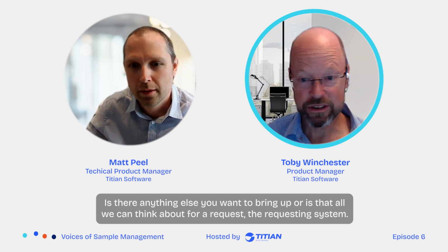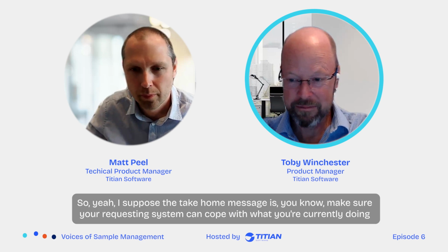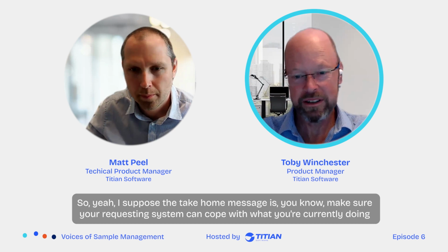Is there anything else you want to bring up, or is that all we can think about for a requesting system? I think we've covered it. Okay. Cool. So I suppose the take-home message is make sure your requesting system can cope with what you're currently doing and what you potentially need to do in the future.